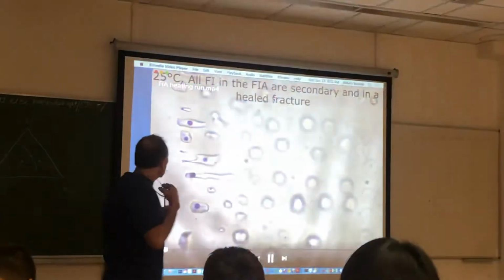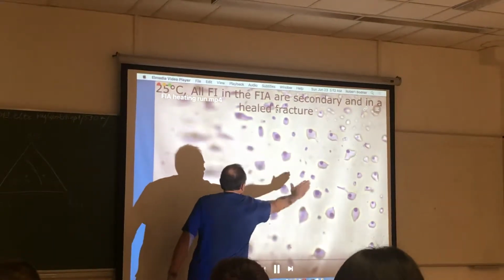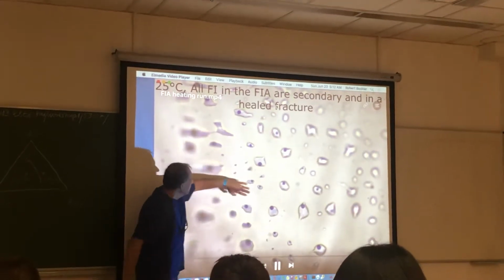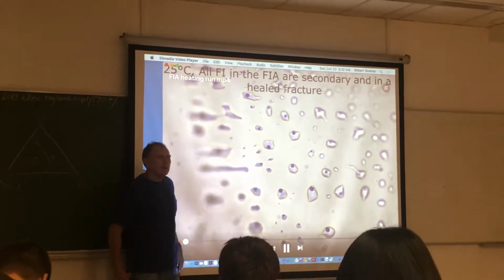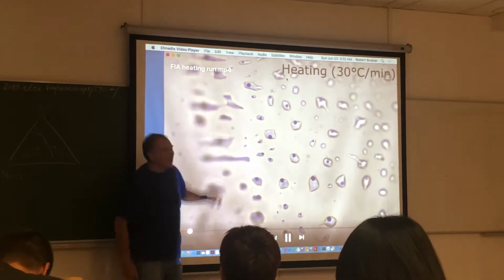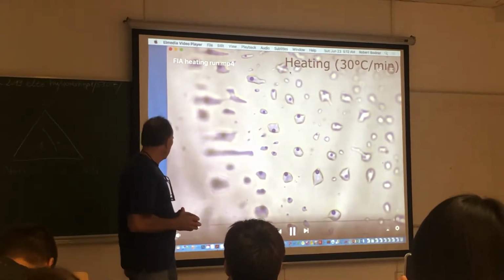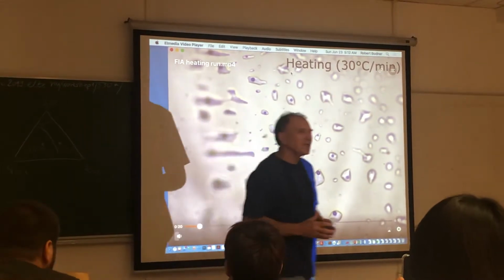Okay, so what we're looking at here is a healed fracture. We're looking down on this healed fracture in fluorite. This is in real time now. Matt is heating at a rate of 30 degrees a minute, so this is a pretty fast heating rate. And it's going to be boring here for about the first 4 minutes.